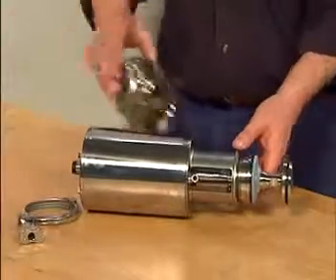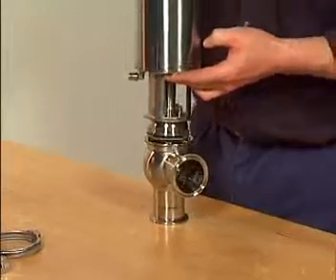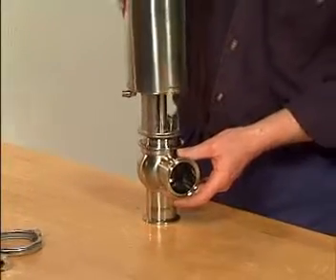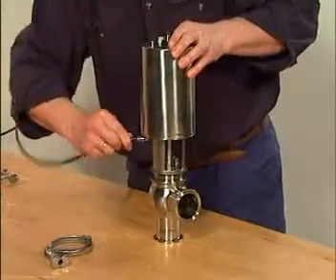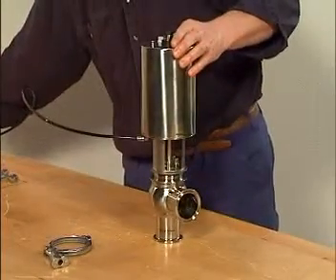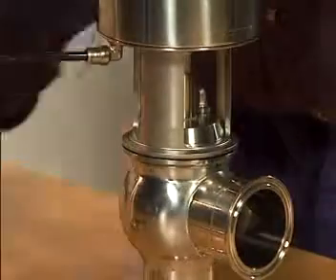Place the actuator and plug assembly on the valve body and supply compressed air. Place and tighten the clamp.